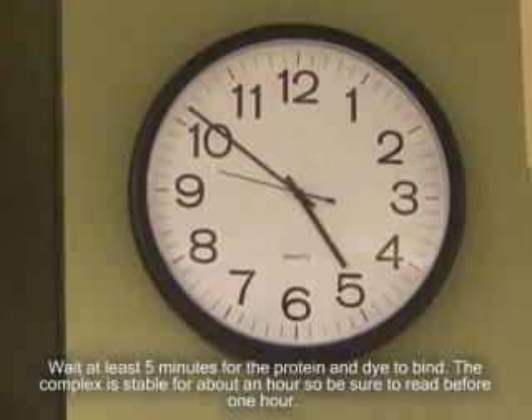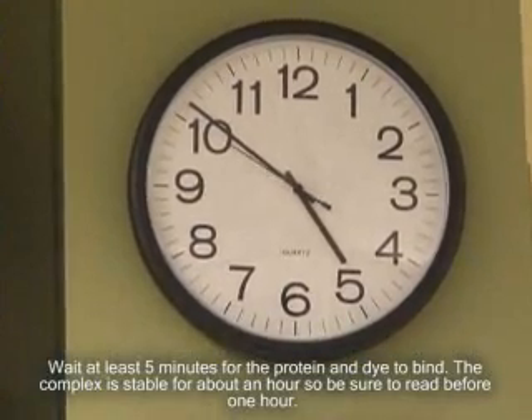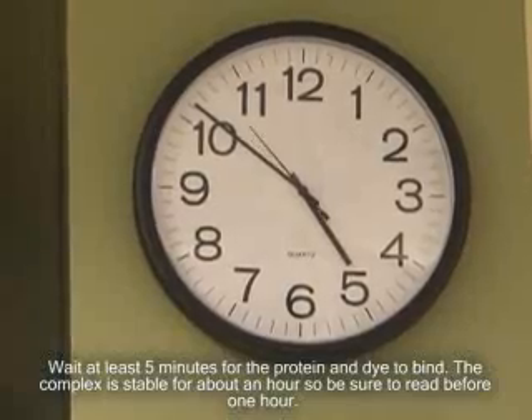Wait at least five minutes for the protein and dye to bind. The complex is stable for about one hour, so be sure to read before one hour.